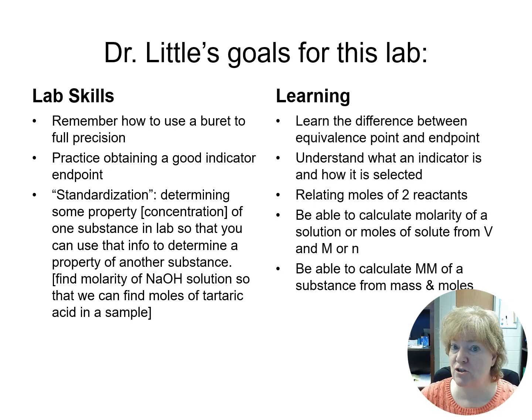In the titration lab, we're going to do a lot of revamping of your lab skills. You've done a titration before in Gen Chem 1 lab, but now we're going to go back. We're going to be able to do a much more thorough analysis of it, and we're going to get into the nuance of why we do titrations.